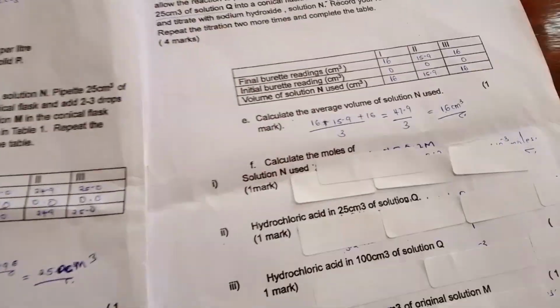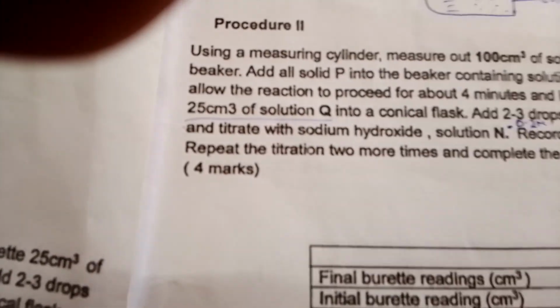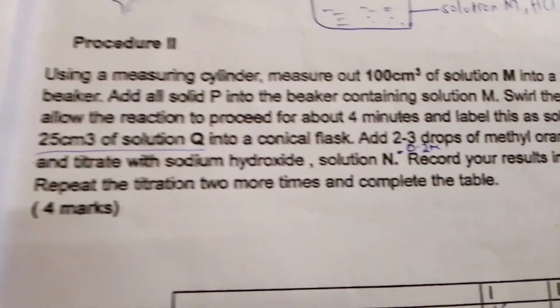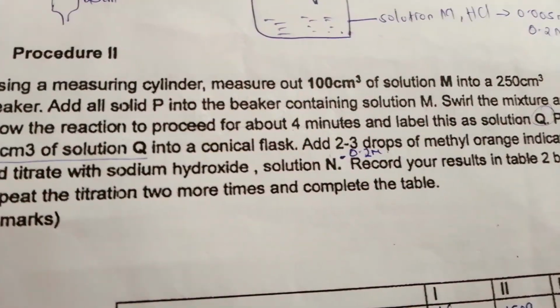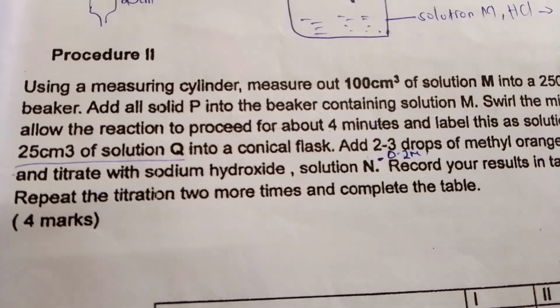Okay, so now we are going to procedure 2. It reads: using a measuring cylinder, measure out 100 cubic centimeters of solution M into a 250 cubic centimeter beaker.